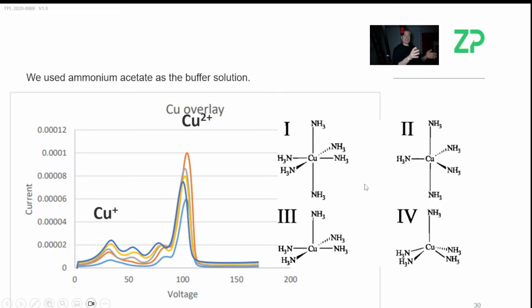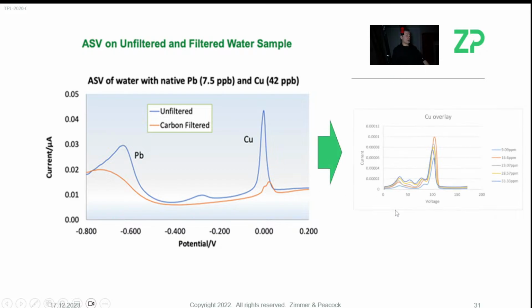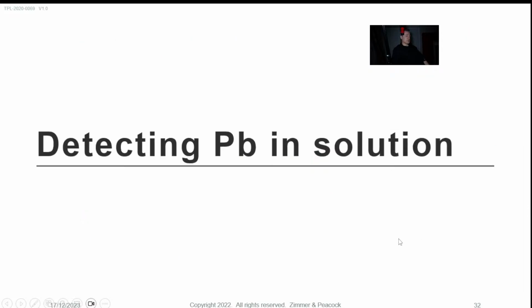To really know what's going on, by the way, it would almost take a master's project to do a whole series of experiments where you were adding things, taking things away. When I say adding things, you try an experiment with ammonium acetate, without ammonium acetate, and you start to understand whether these peaks are linked to ammonium acetate. But you have to do it in quite a systematic way. As I say, the big difference between what we've done and what you've done is, I think, that ammonium acetate. I suspect that at least is a rational reason as to why you get these extra oxidation peaks.